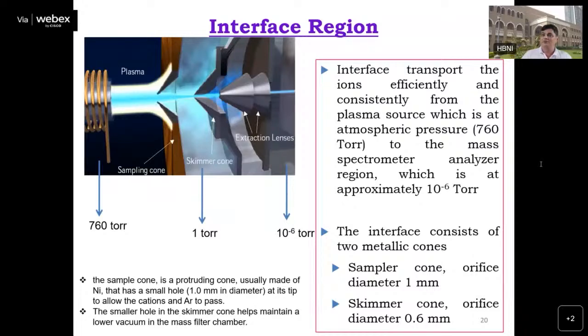But definitely, if you meet the ideal conditions which are given in the manual, you will definitely get those detection limits, because the detection limit given in the manual is a very rugged one, because the company in general does a lot of R&D before putting those values there. But you have to see what ideal conditions they have defined. Understand? So it's possible that you can meet those conditions.